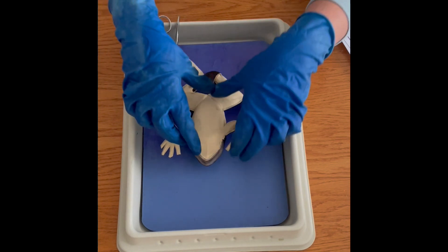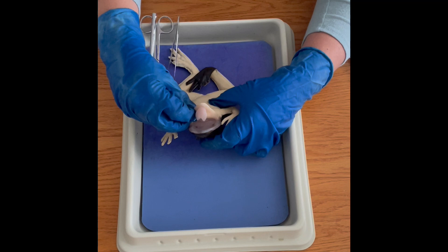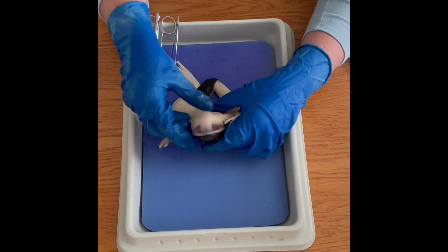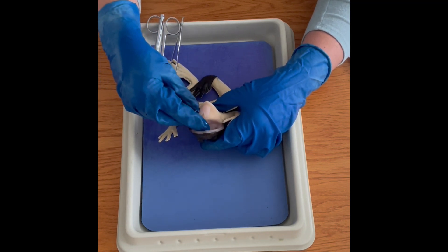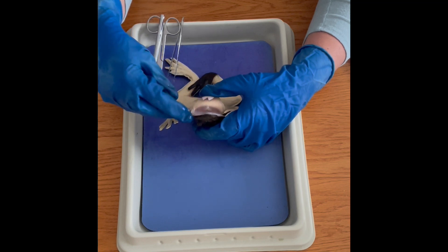Then we look in the mouth. The mouth folds back actually much more easily than a real frog's mouth, which ends up being quite rigid. You can fold that jaw back and see the tongue does flip out from the front as a real frog's would — so the point of attachment is correct there.